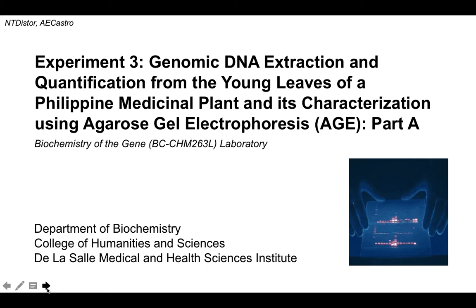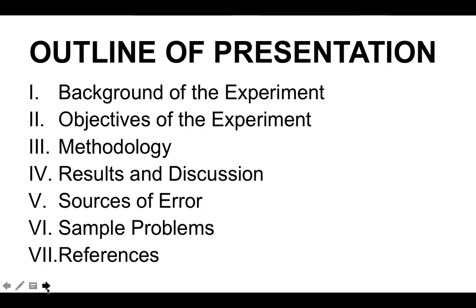This laboratory session is divided into two parts, part A and B. For part A, we will cover plant DNA extraction up to spectrophotometric analysis of DNA quantity and quality. Discussions covering part B will be made available next week, Thursday.